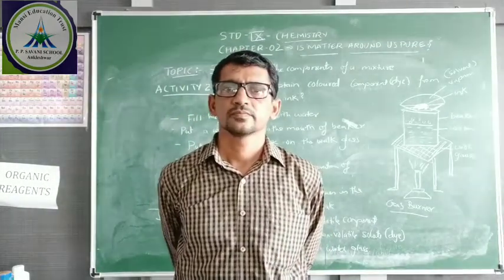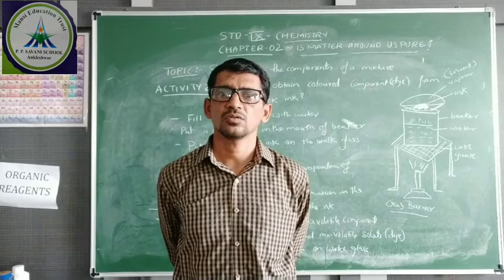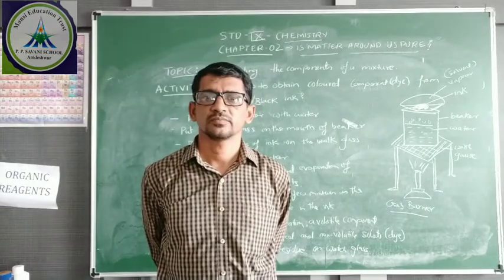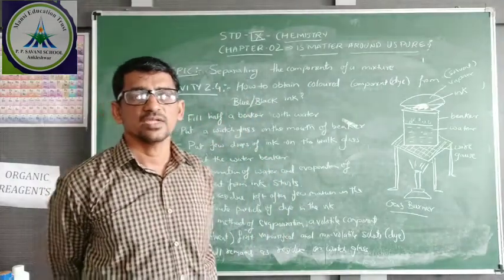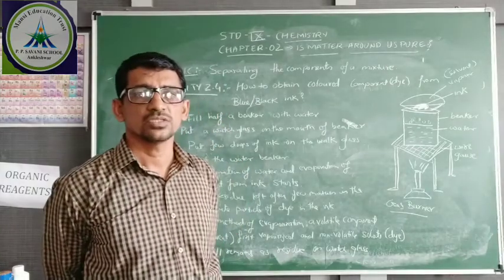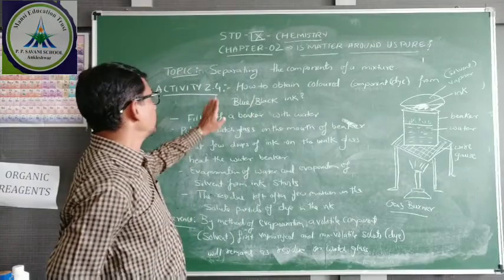Hello students, welcome to chemistry chapter number 2, Matter Around Us: Pure or Not. In that we try to separate solute and solvent. By different techniques we can separate the solute component from the solvent. One of these techniques is evaporation. How this evaporation takes place, we will discuss today in our activity number 2.4.